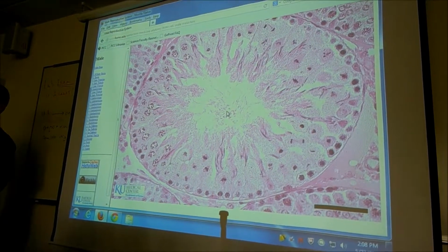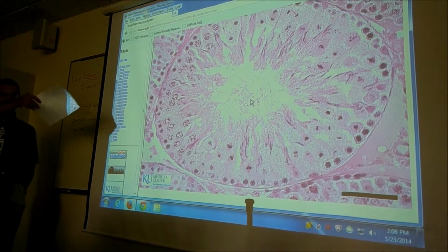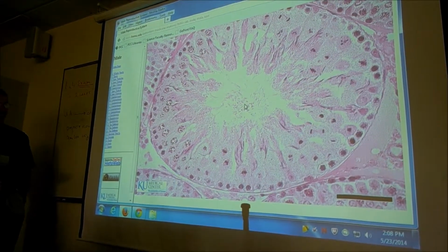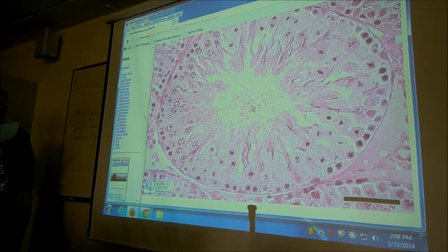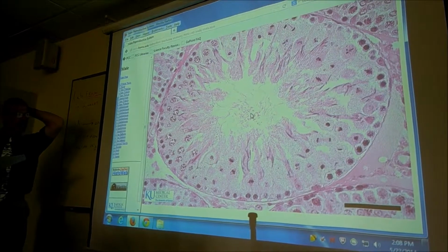All right, let's walk you through some of the slides. Next week is mostly all slides all the time. So, what is that? What organ is this from your quiz? That's a testis. That's a seminiferous tubule inside a testis. So, you're supposed to review the testis again. You know this. Let's review now some of the cells.